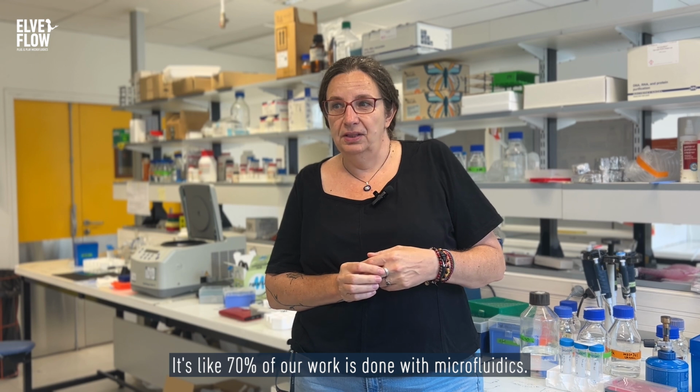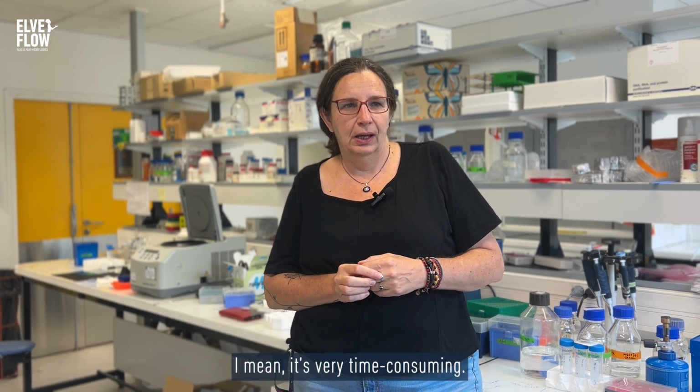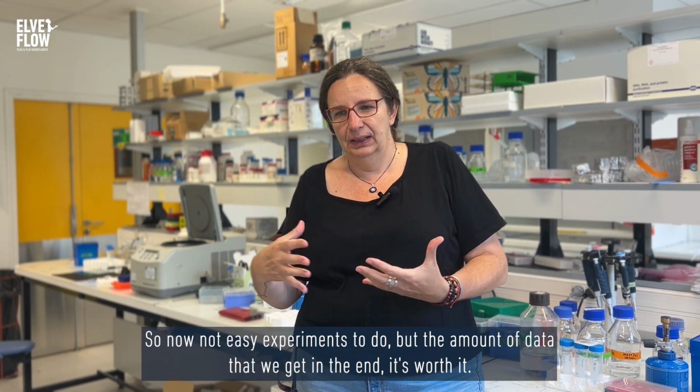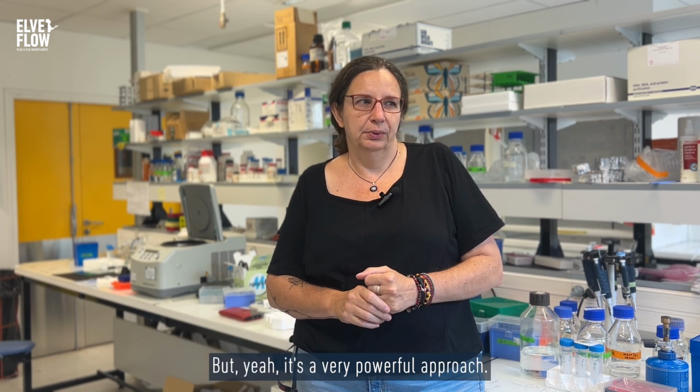It's like 70% of our work is done with microfluidics. I mean, it's very time consuming. It's not easy experiments to do, but the amount of data that we get in the end is worth it. It's a very powerful approach.